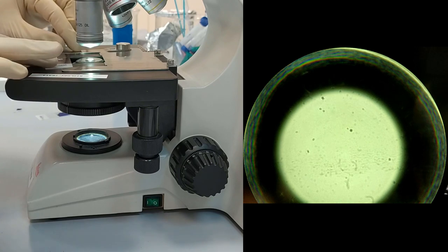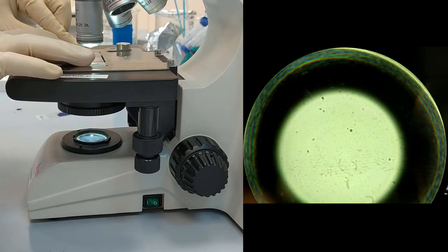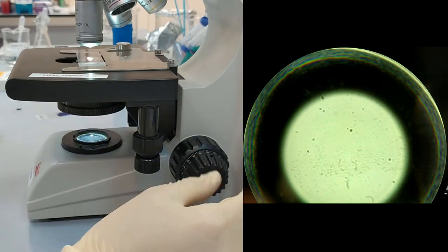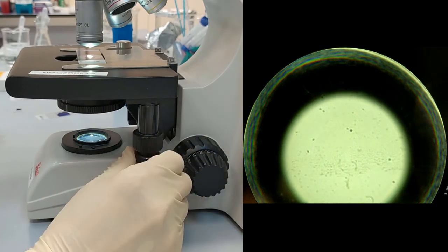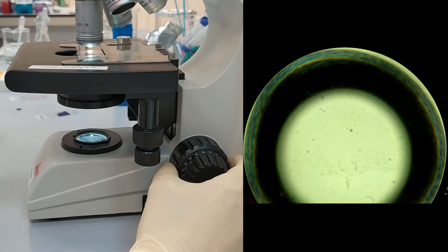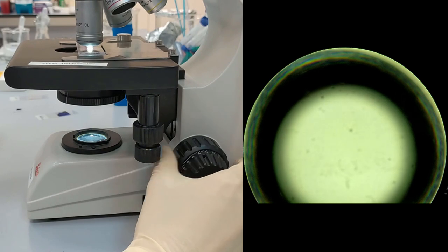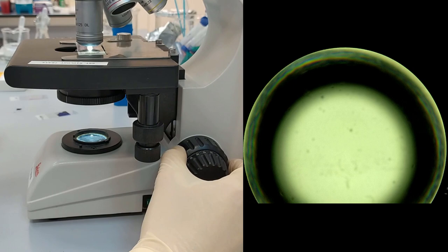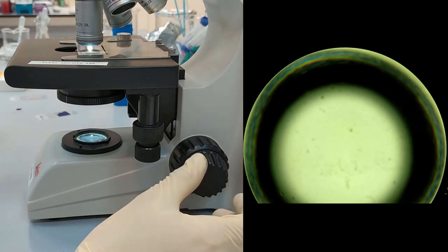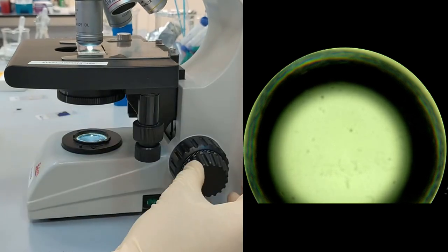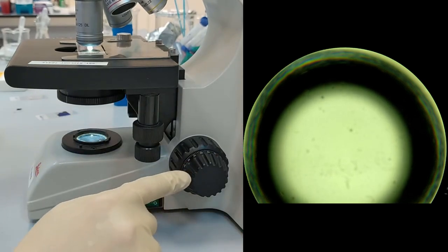Place this drop beneath the objective and under the control of your eyes, we start elevating the stage. When the objective and drop touch each other, using the big knob, we go a little lower and then start working with the small knob.